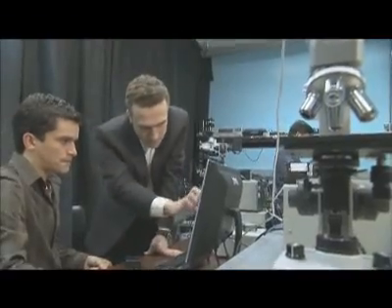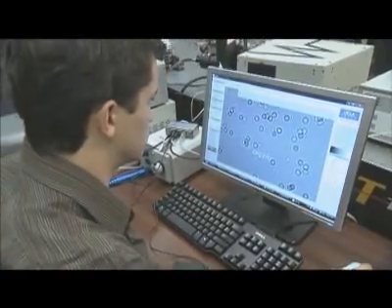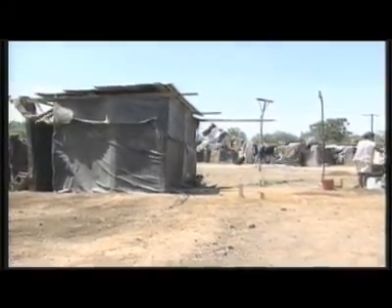"What most excites me about this technology is the speed that it enables. We can look at literally millions of cells per second, all with the holographic resolution that we want." And it might just give hope to people living in parts of the world where diagnosing what's wrong quickly and inexpensively could mean the difference between life and death.